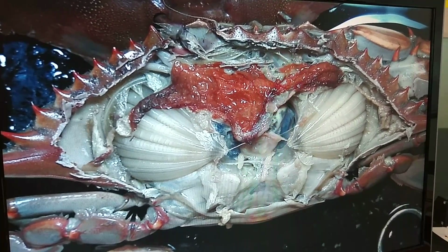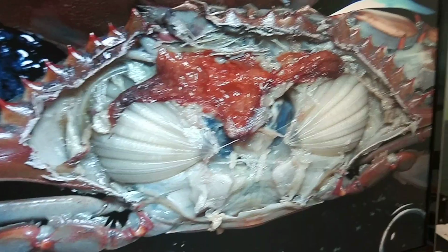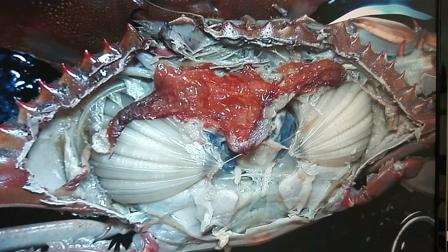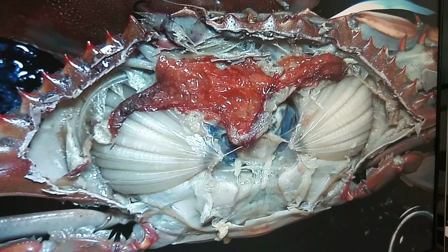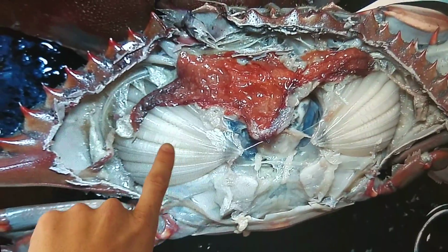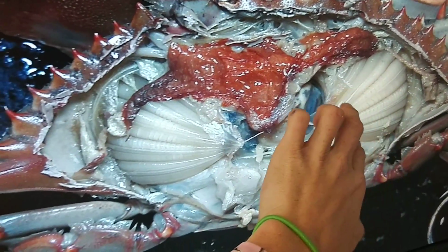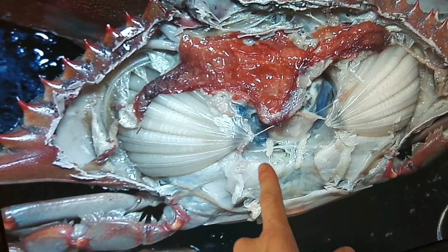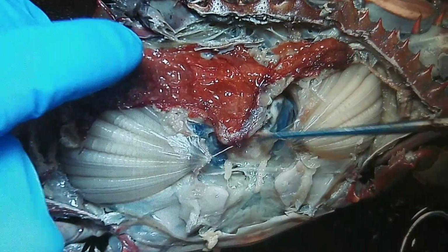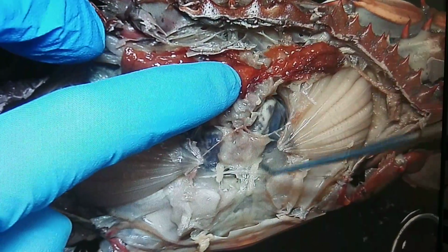Think back to the squid dissection. At the base of each gill, what was there? The heart, right? So what are these? On this side? Still gills. Look what they're pointing to. The gills are pointing to the heart. You can't see it here because the light really sucks.